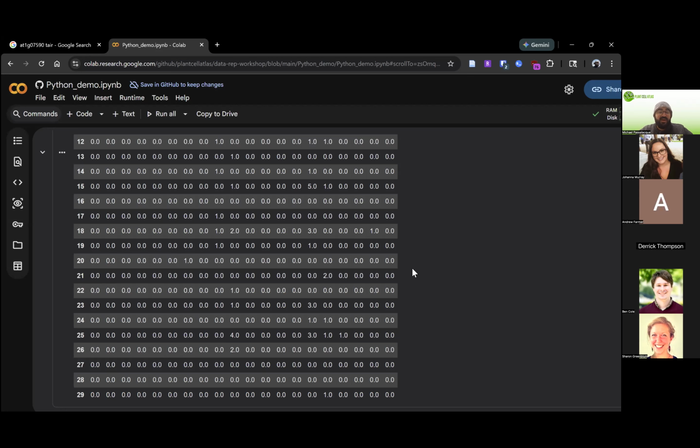There's also, if you're getting that from SRA, SRA tools, which is a way to download directly from SRA. That's quite quick to download directly to the Linux environment.